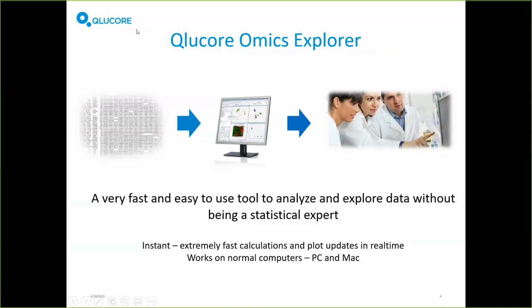Also, it works on normal computers. You don't have to run this on a very, very fast computer. You don't have to run this on a cloud server or something. We offer this for PC and Mac, and you can run it on a regular laptop, actually.